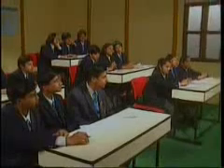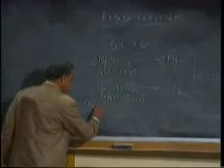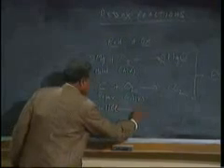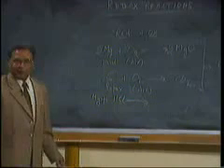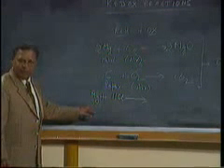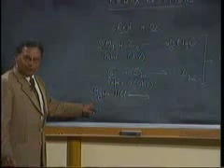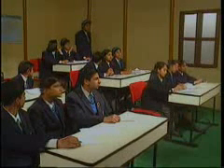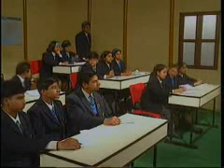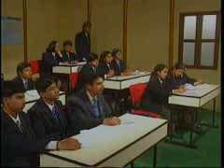So what I have done in this particular case is I have taken the same magnesium plus added hydrochloric acid. What change do you think has taken place in this case? What reaction has taken place? Yes, Kopika? Yes, this is MgCl2 plus H2.